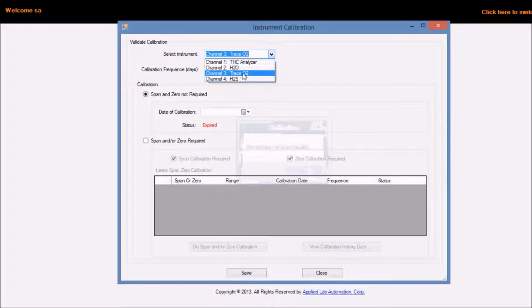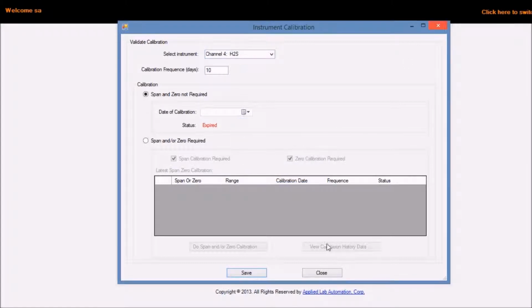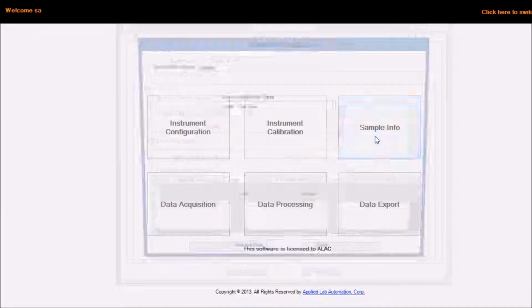Of course, the ability to edit the calibration will depend on your administrative rights. Maybe best if it's limited to supervisors with the rights to edit the calibrations.